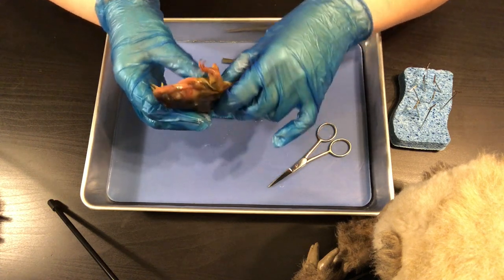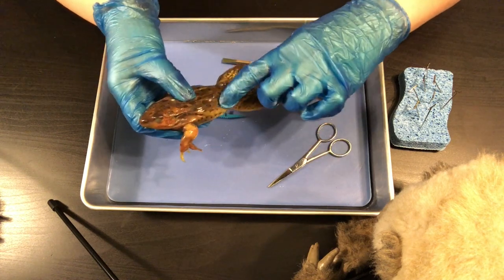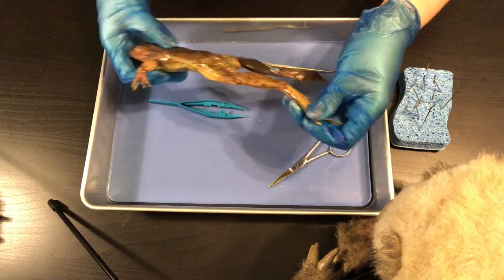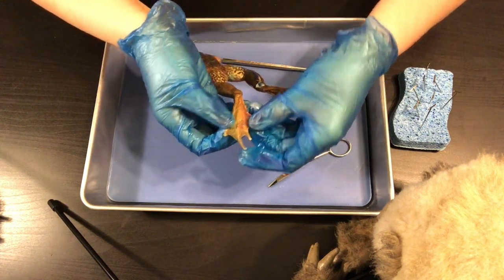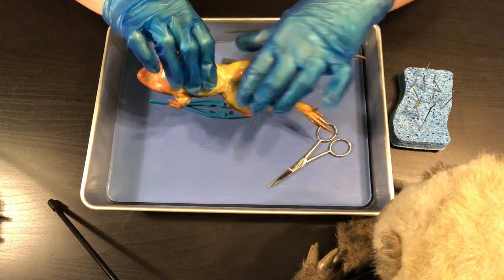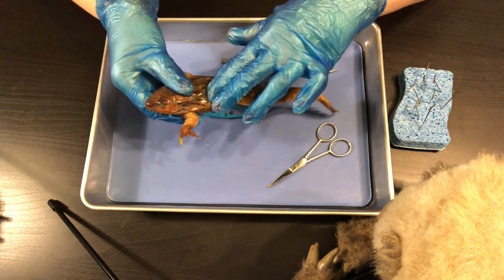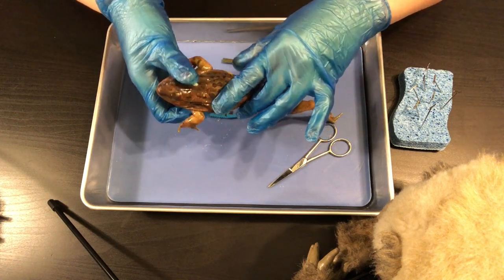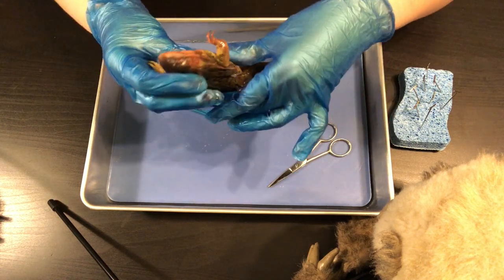I want to point out a few things about your frog from the outside. Remember that frogs are amphibians, so they have webbed feet — you can see their webbed toes right here. They also have really strong leg muscles that help them hop around, and skin that they're able to breathe through. They can absorb oxygen through their skin because they live on land and in water.